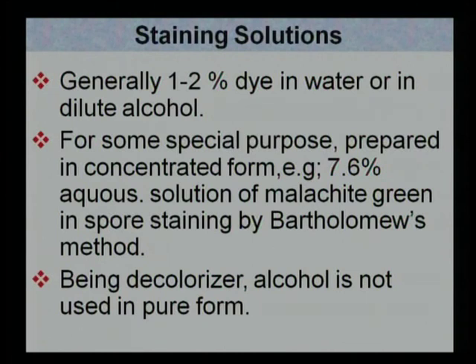Normally, higher concentration is not used in staining. The thumb rule is you use the concentration which is slightly less and increase the time, rather than using a higher concentration of the stain and going for less time.